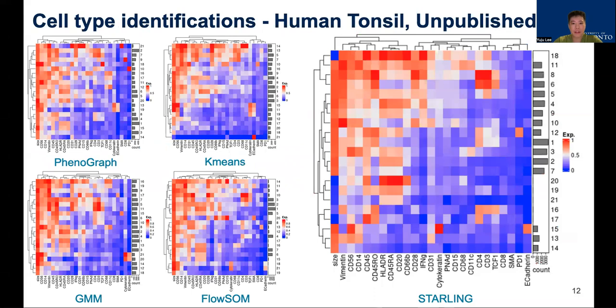Currently, we are investigating how Starling centroids compare to other clustering methods, as there are identifiability issues among clustering results. Starling uses GMM initialization, which is shown in the bottom left plot. The Starling centroid plot on the right is based on lambda 1 and cofactor 5. Starling seems to suggest clusters 16 to 20 as doublet clusters because no cells are assigned to them. The preliminary results suggest Starling identified cleaner cell types and possible cell types that are not revealed in other methods.